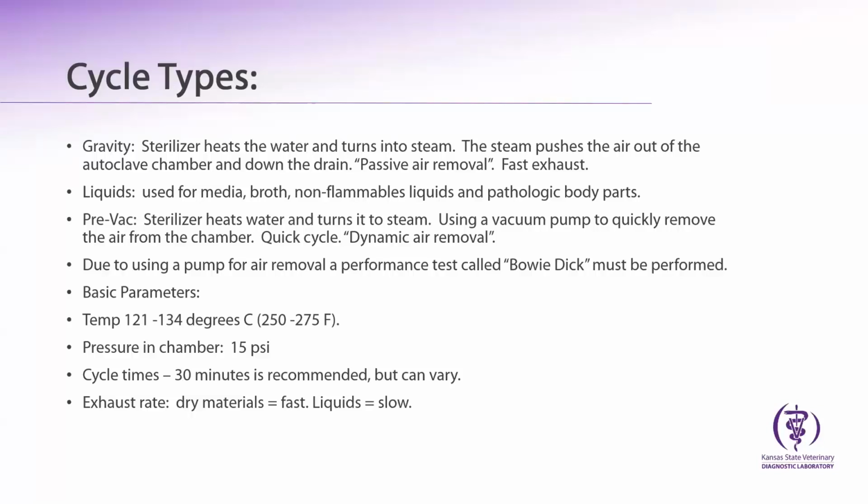So it's basically like having a stack of index cards and you have a card in the middle of that stack that actually has a dye pack that has to explode. And if you don't have air removal throughout your entire machine, you're going to have spots because this will start out white. Those spots will show up yellow. But if it truly passes, you're either going to see blue or black depending on who your manufacturer is. It's almost kind of like a little maze within the card system that you will actually see that's going to test your air removal within your machine.